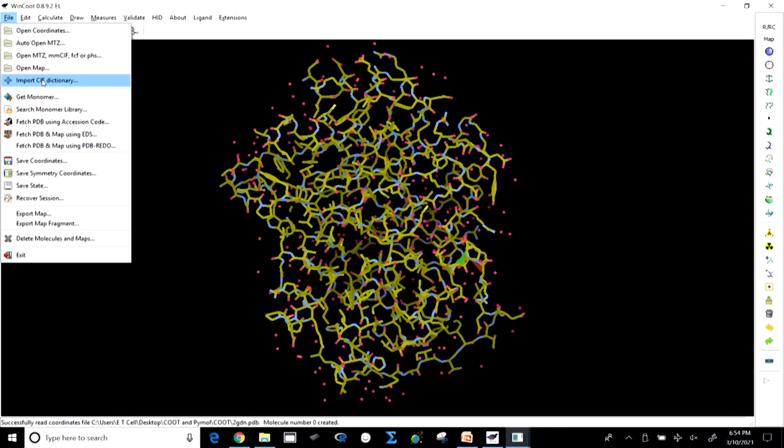The atoms are made of all those standard amino acids, nucleic acids, lipids, carbohydrates, water and all. Heteroatoms are what you are developing, a new drug or something.